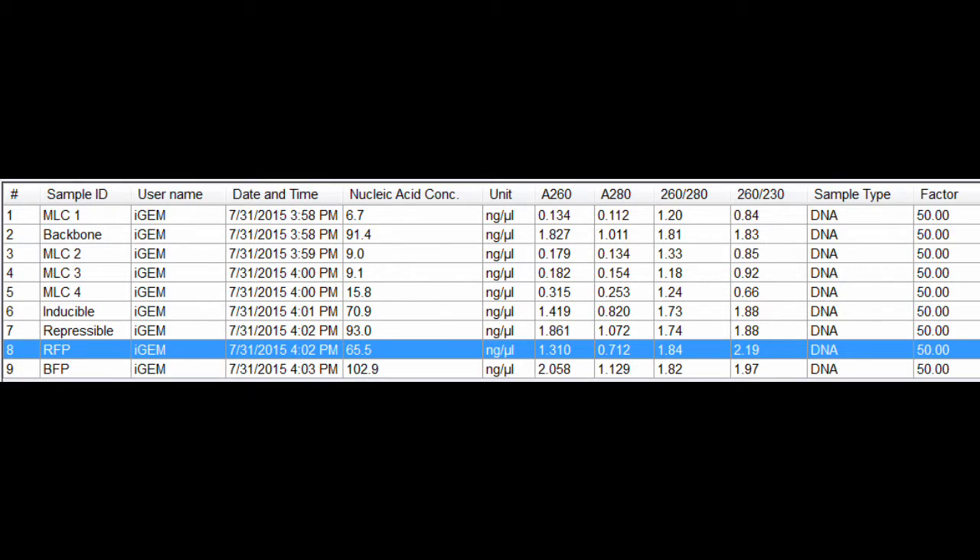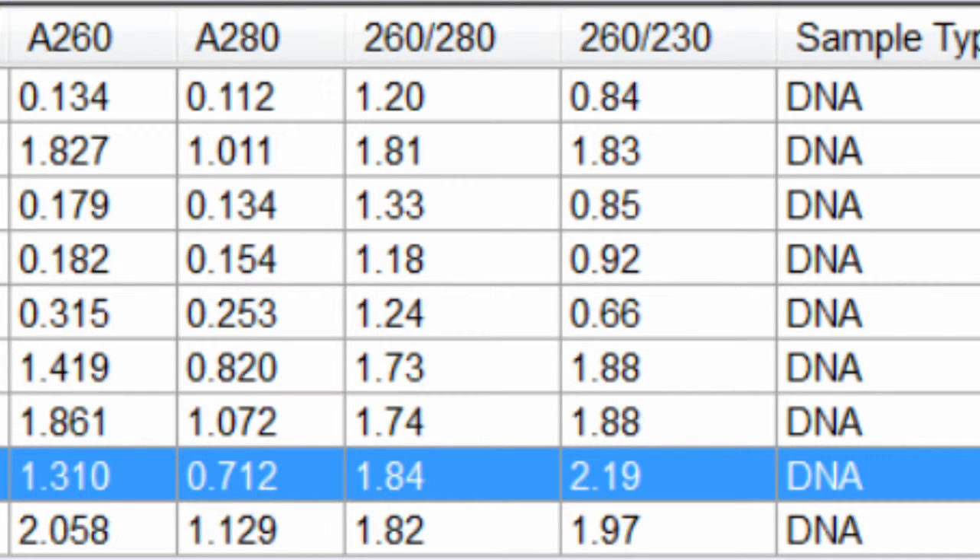The purity of the sample can also be known by the 260-280 and 260-230 absorbance ratios. Contamination of proteins, organic solvents, or various other compounds will skew these ratios. Pure DNA should generally have a 260-280 value of 1.8, and a 260-230 value ranging between 2.0 and 2.2.